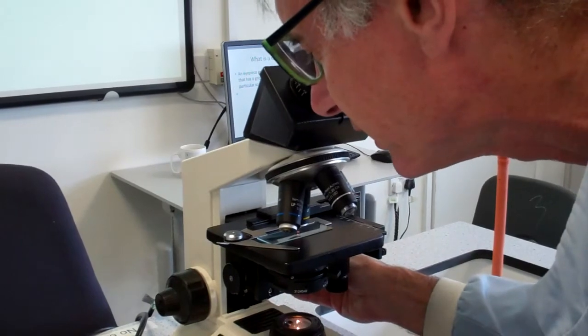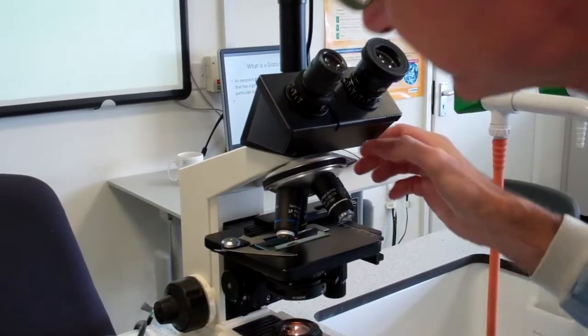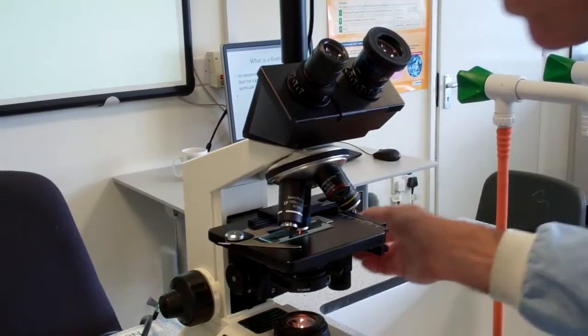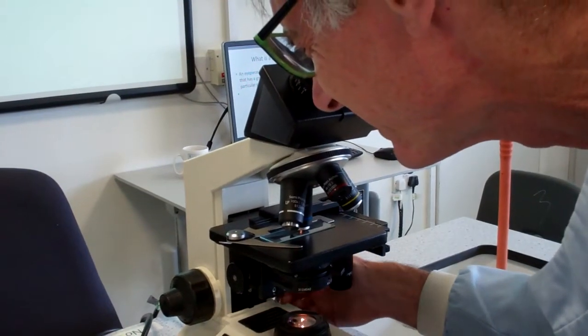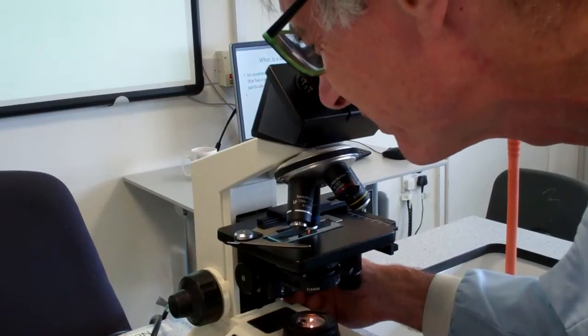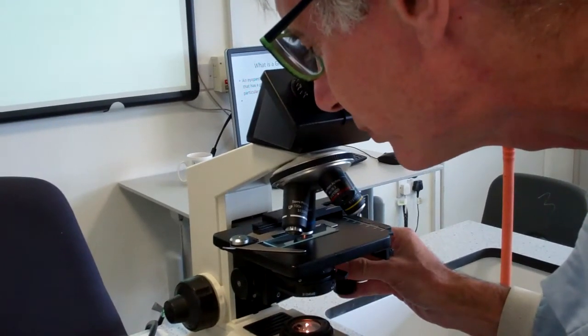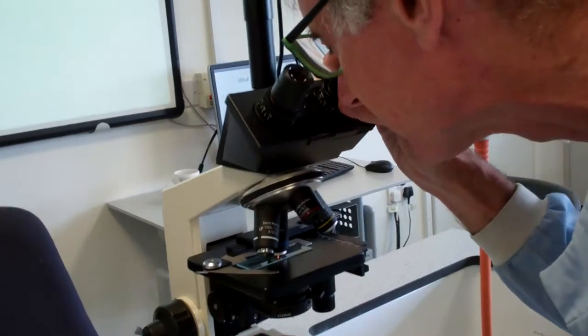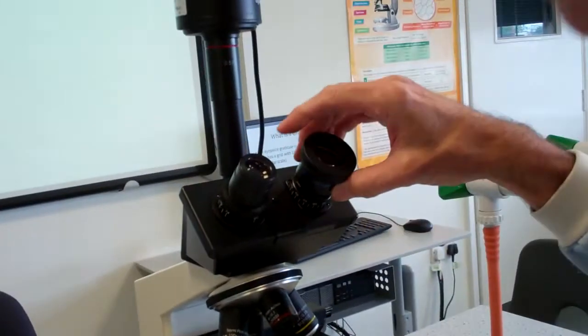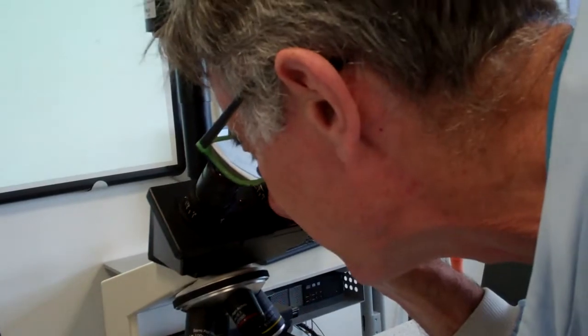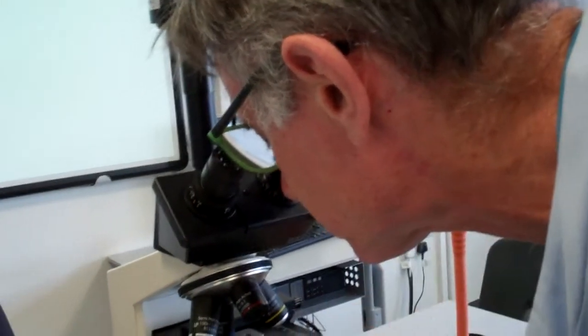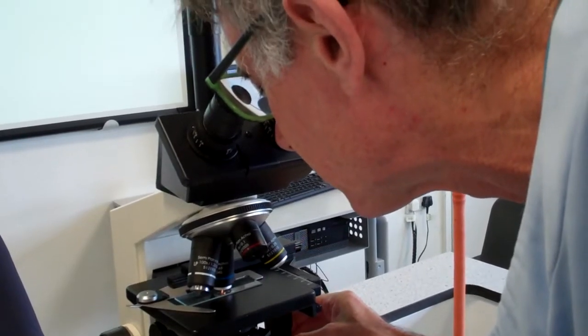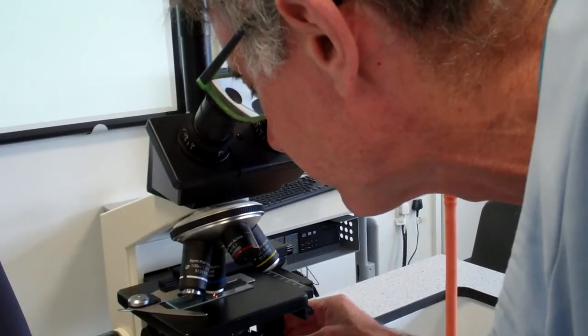We're going to calibrate it first using 400 times magnification with the blue lens. Move what you see here to the middle, and now look through this lens. The handy thing about this is it rotates, and you line up your eyepiece graticule with the stage micrometer.